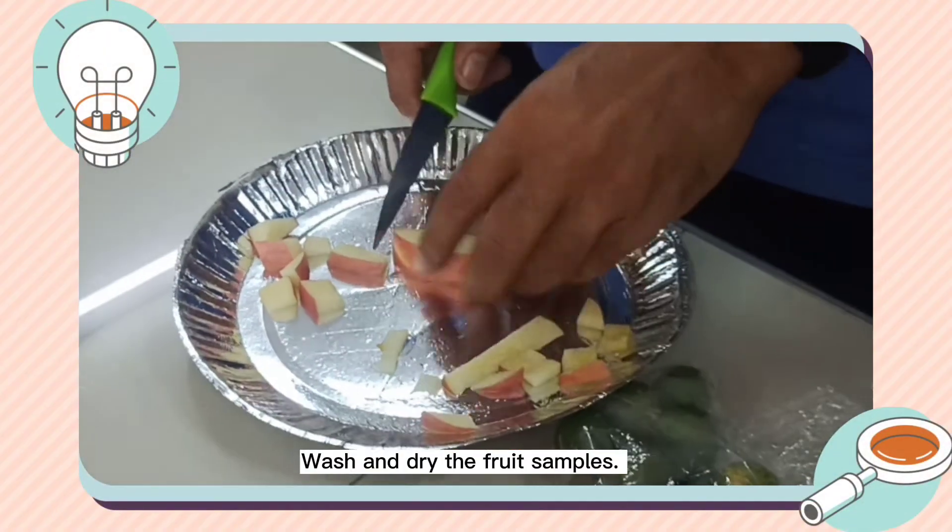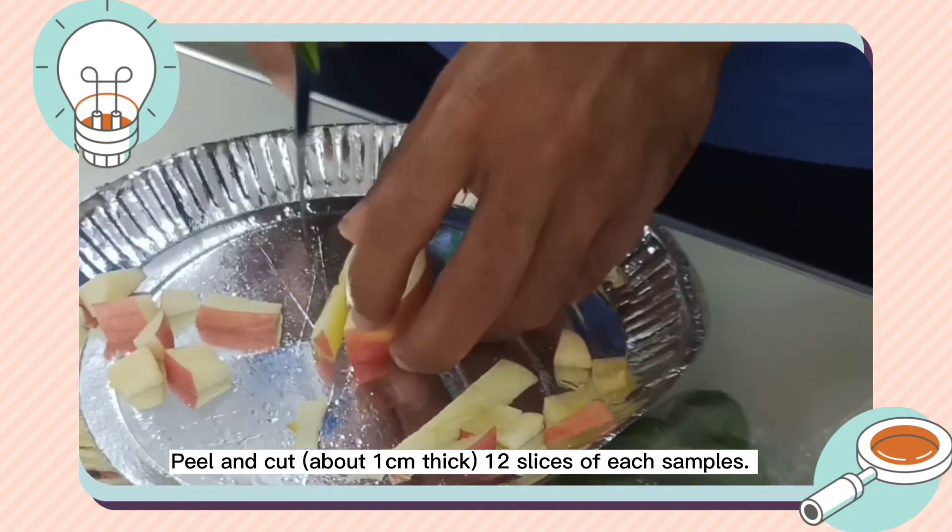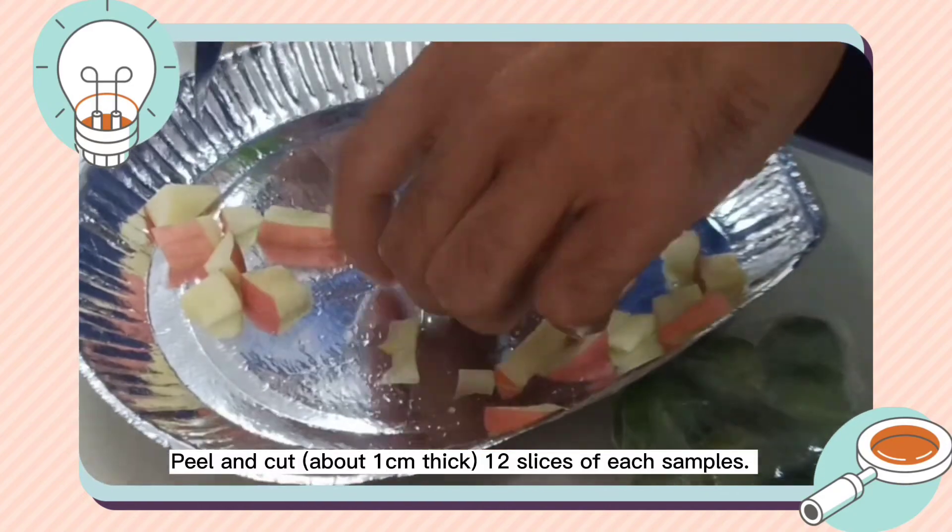Wash and dry the fruit samples. Peel and cut about 1 cm thick, 12 slices of each sample.